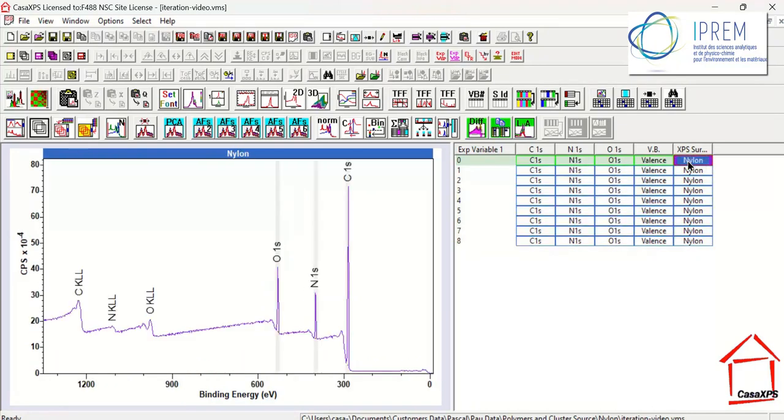The only other spectrum with some processing in the sense of regions defined is this survey measurement. The other survey measurements are without regions.